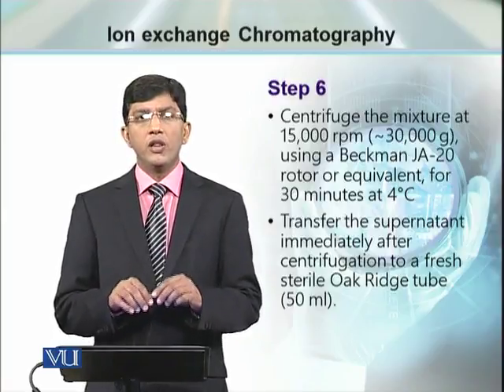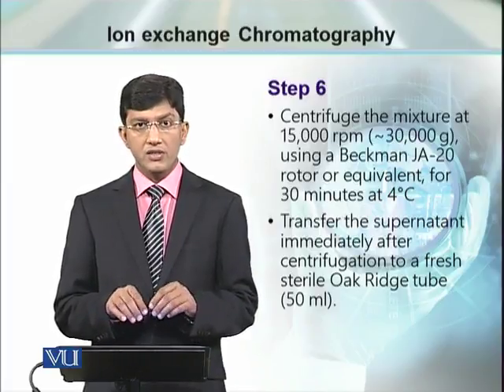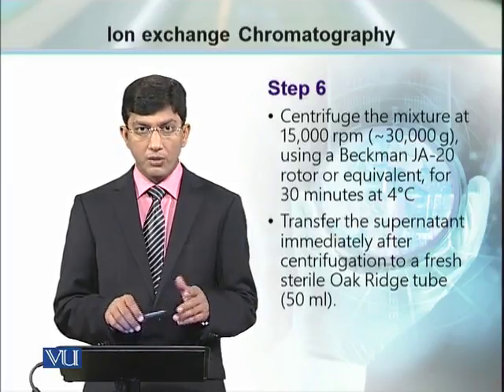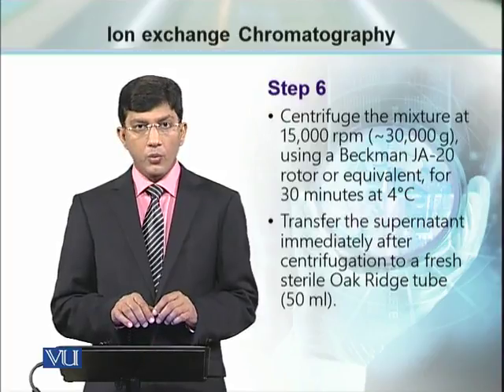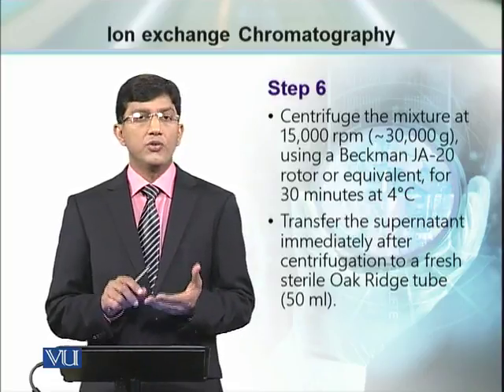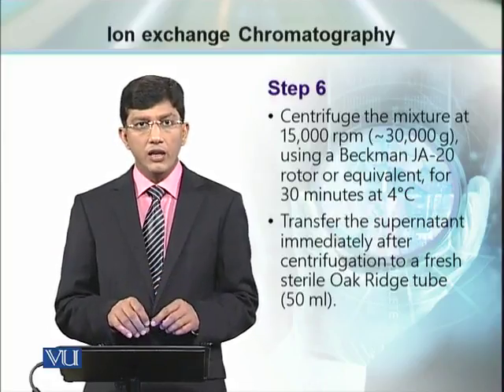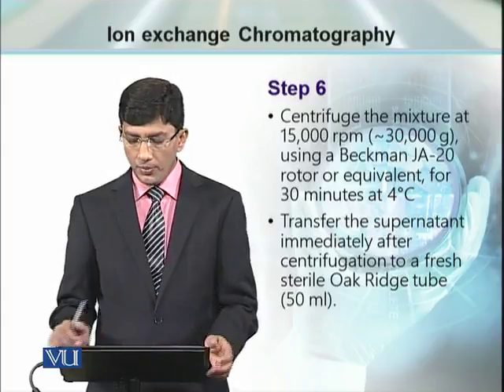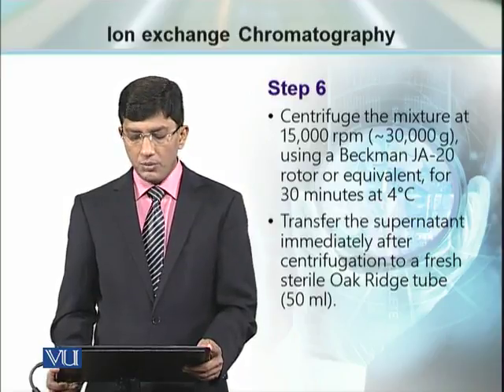Now, in order to remove all the cellular debris, all the unwanted particles in this lysed cell suspension, we have to centrifuge it at 30,000 G using the Beckman centrifuge for 30 minutes at 4 degrees centigrade. Once this centrifugation is completed, the bottom of the tube is going to have all the unwanted particles. It will have protein and broken cellular particles, and the supernatant has our required plasmid DNA. We need to transfer this supernatant immediately to a new fresh 50 milliliter tube.